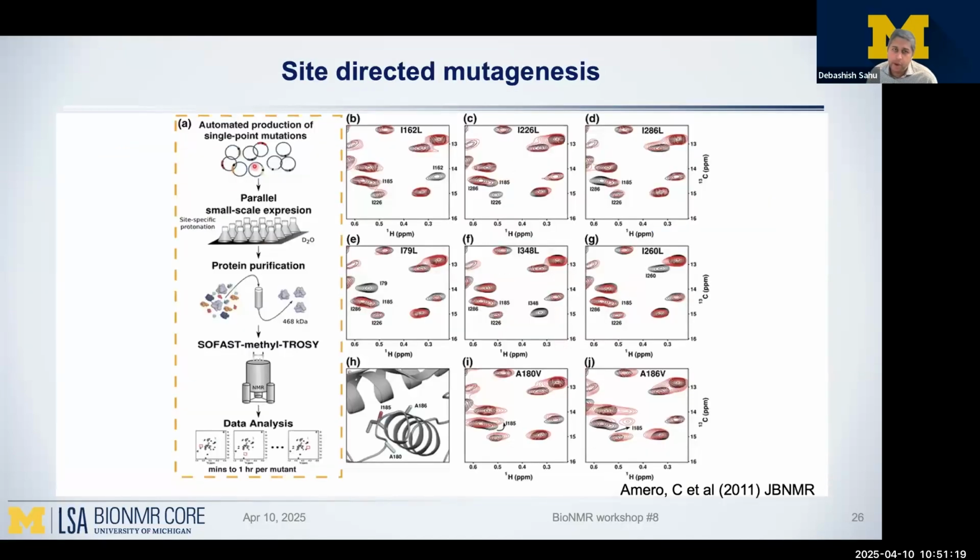Here the goal is actually not to complicate the lives of a person who's making thousands of samples, but rather they were trying to look at what are good substitutions. Basically, if you want to assign that particular isoleucine, what is a good amino acid to convert it to? They give you good recommendations of converting an isoleucine to leucine. You will lose one of those signals of your isoleucine once you do that conversion. So in this case, you have two samples. One is your wild type.